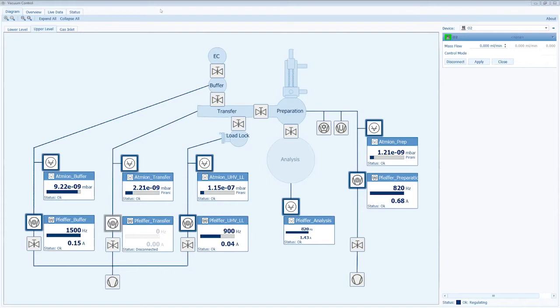Well, when we need something with the software, we usually ask Specs. This is something we don't do by ourselves, the software-related things. However, with the machine, like servicing the pumps, and even Michel's experience fixing the X-ray source, those we are mainly able to do by ourselves, because it's faster and cheaper as well. And we are more efficient if we can do it ourselves.